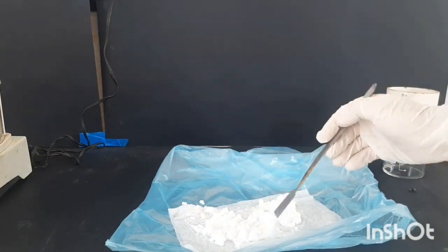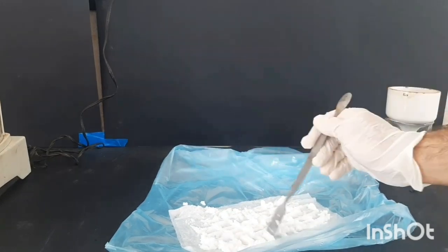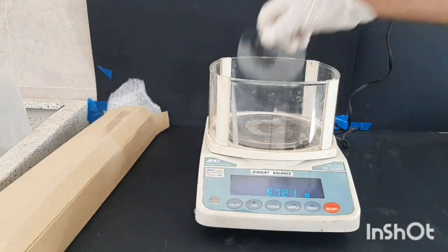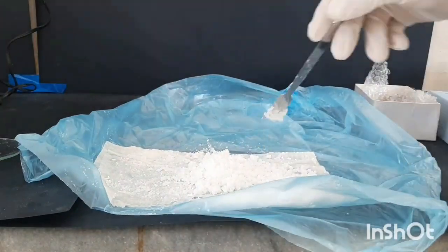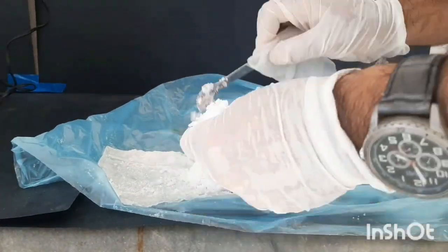So I just moved around the adipic acid a little bit and removed the magnetic stir bar. I'm gonna leave it for 24 hours to dry. One of the reasons that paper towel is not a good filter paper is that it tends to stick to the product.